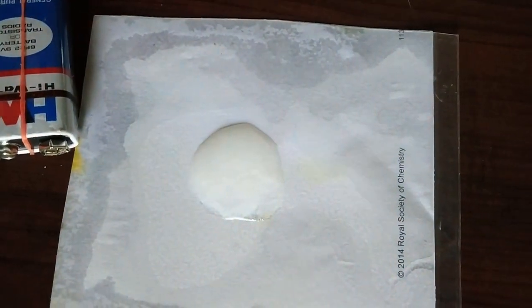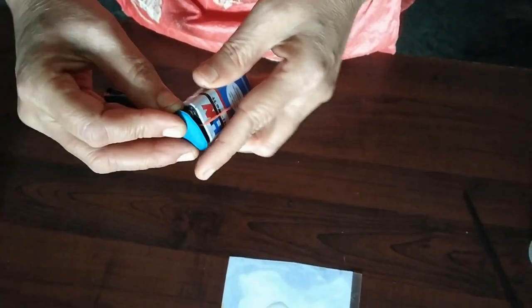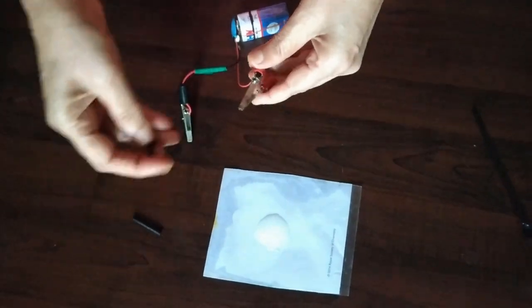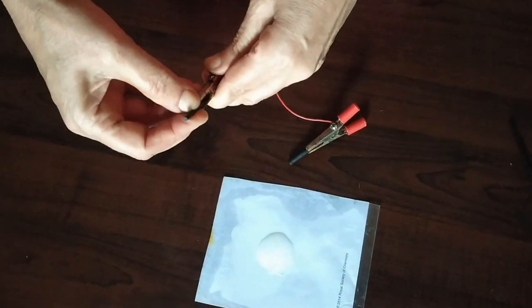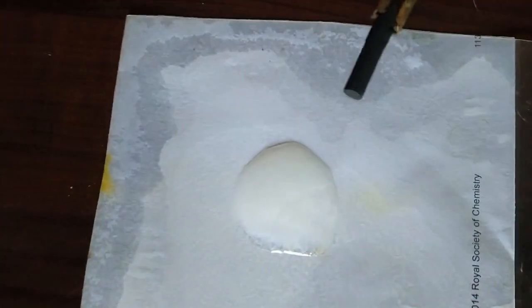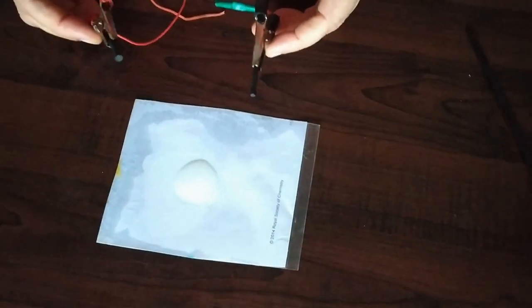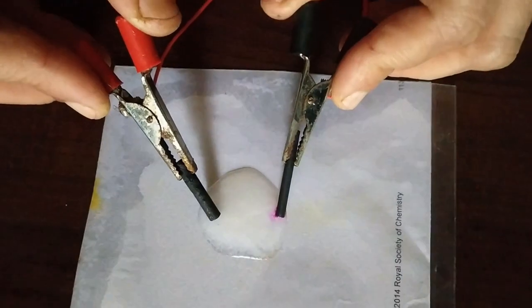Now we shall prepare this cell, and you get this in the shop. Even this crocodile clip is available in electronic or electrical shop. To this you fix these carbon rods or pencil. Even pencil can be sharpened both the sides and that can be used, or pencil lead can be used. Now keep this electrode 1 inch apart in the cell, in the solution that we have prepared on the laminated sheet of paper. Now keep these electrodes just a little apart in the solution.